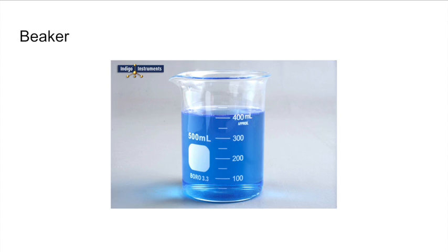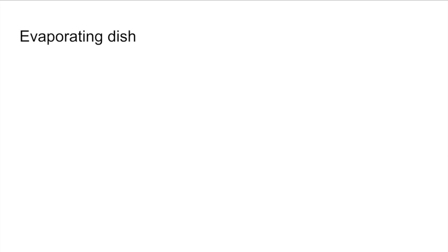This is a beaker. Beakers are useful as a reaction container or to hold liquid or solid samples. They are also often used to catch liquids from titrations and filtrates from filtering operations.